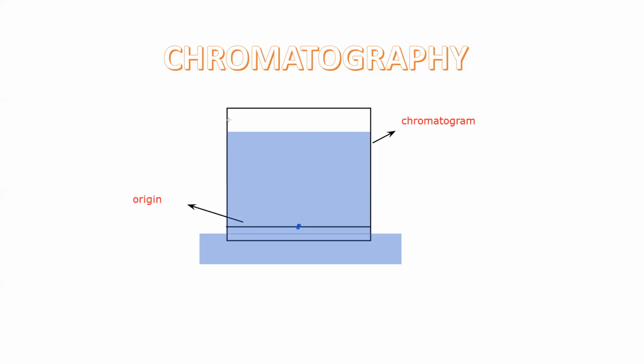The last point where the solvent rises and stops rising, after that it does not rise. This last point where the solvent rises is known as the solvent front.